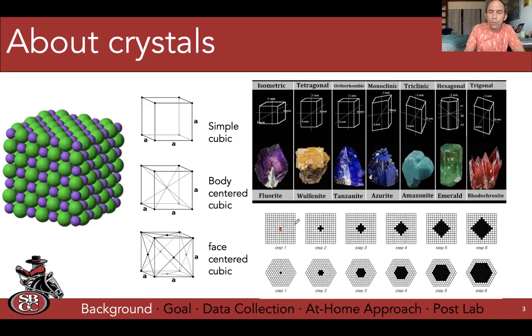And then our goal is to add unit cells repeatedly as slowly and carefully as we can, so that then our overall shape of our macro crystal is a reflection of those added, very ordered unit cells. And again, you can nucleate crystals that are cubic in shape, and you can have hexagonal shaped unit cells with hexagonal shaped crystals, like emerald here. And so using my Legos as an example, my goal is that if I have these in solution and they're free moving, I want to get them to latch up just perfectly, right?